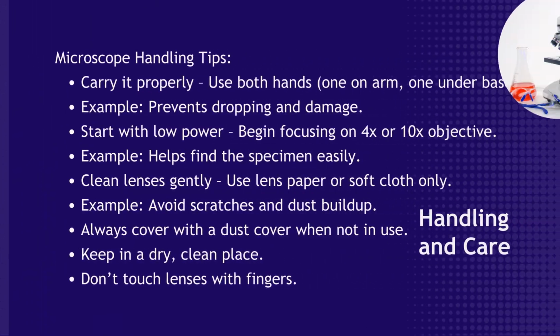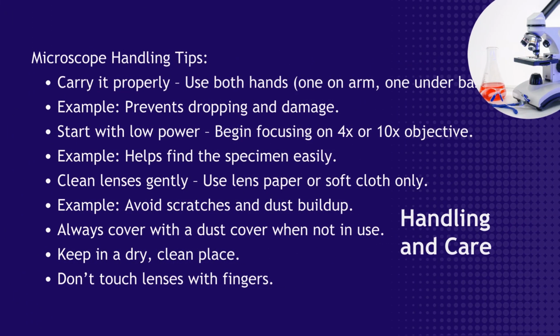Handling and care of the microscope. Handling tips: carry it properly, use both hands, one on the arm, one under the base. Example, prevents dropping and damage. Start with low power, begin focusing on 4x or 10x objective. Example, helps find the specimen easily.